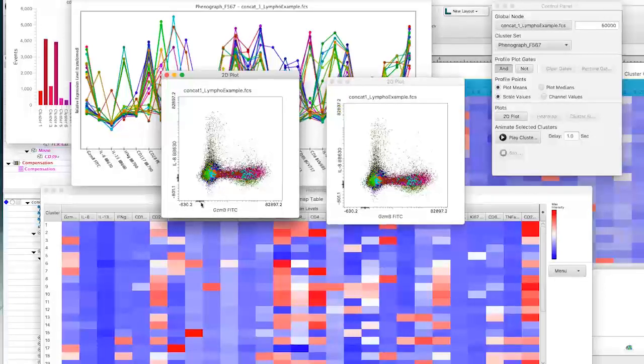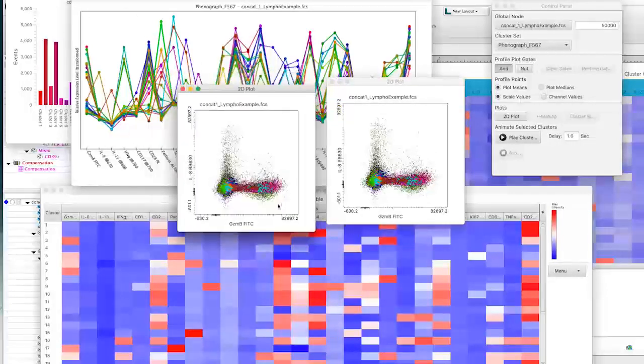Now see the data space, right? We've got a bi-exponential transform, we've got different log scales. We basically take the visual data space and we bin it from 0 to 4096. And that is what we represent here as binned data. So scaled or transformed data. We're looking at the transform space.